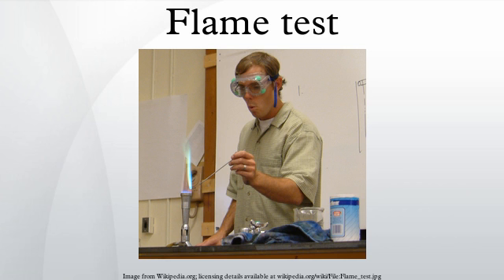Different flames should be tried to avoid wrong data due to contaminated flames, or occasionally to verify the accuracy of the color. In high school chemistry courses, wooden splints are sometimes used, mostly because solutions can be dried onto them, and they are inexpensive. Nichrome wire is also sometimes used.